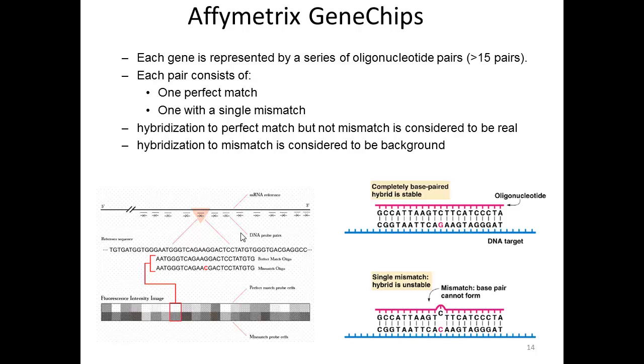Now in spotted microarrays, you sort of had built-in quality control because whatever the abnormalities of printing that PCR product, both samples are going to experience the same deficiencies and be affected in a similar way. So that's sort of allowing for imperfections to still give you reliable data. With Affymetrix chips, we're using different chips for different samples, and so quality control becomes extremely important if you're going to be able to compare two chips.